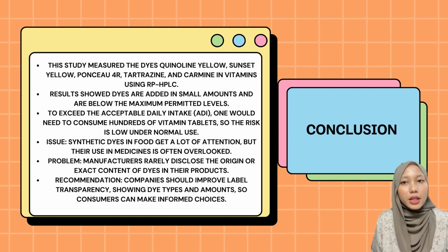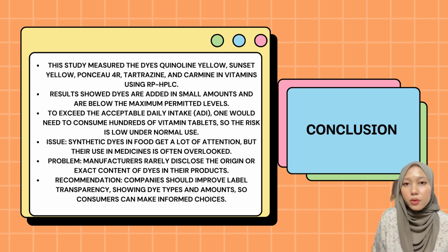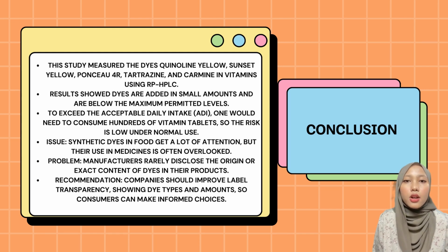It also reveals that these dyes are added in small amounts and remain below the maximum permitted level set by regulatory authorities. So, the findings indicate that exceeding the acceptable daily intake (ADI) would require consuming hundreds of tablets, making the risk minimal for normal users.